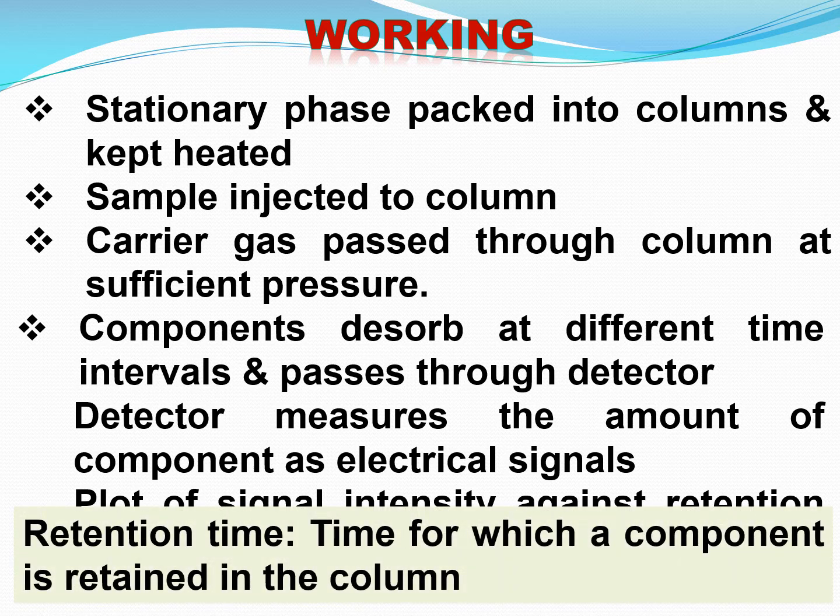Retention time is defined as the time for which a component is retained in the column. This is an important definition: time for which a component is retained in the column.